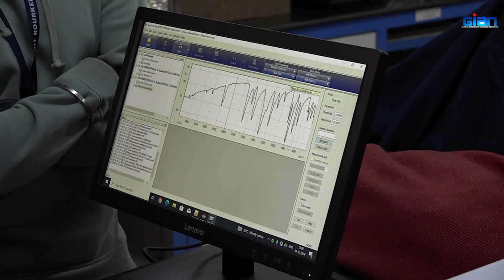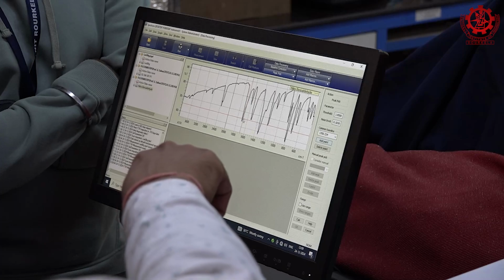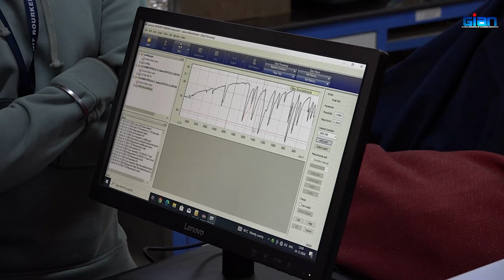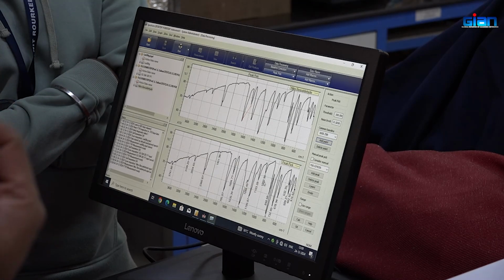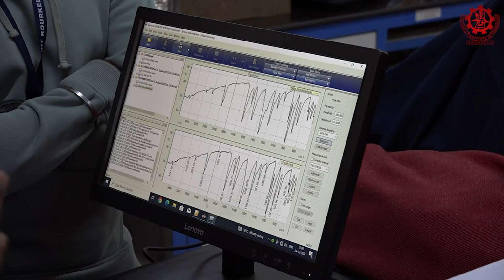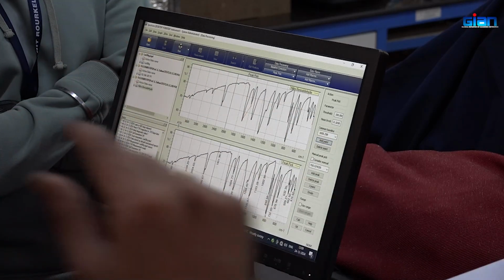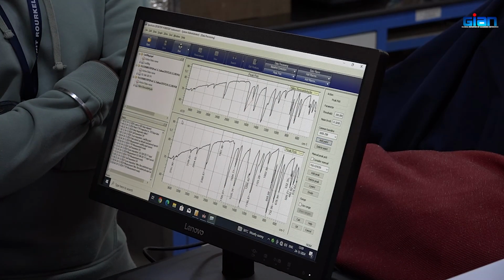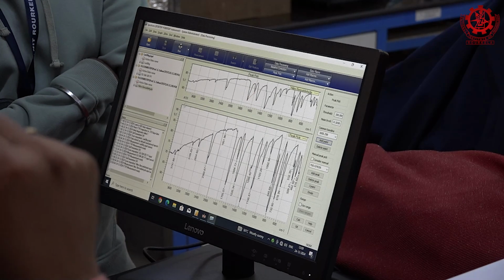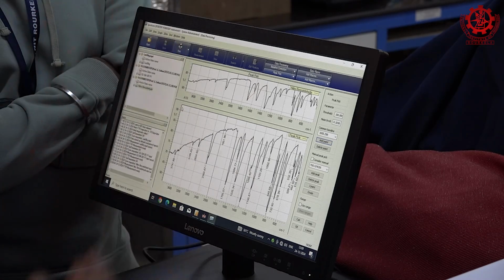Okay. So, now you see the spectrum is different from what we did last time. We used the solid compound, everything is the same, only the operation differs. There we put the solution and let it evaporate, but here there is no such thing. We just took our compound, put it on there, and remember it has to be pressed. The reason behind that is to make a thin and homogeneous film, because then it will absorb with equal intensity.